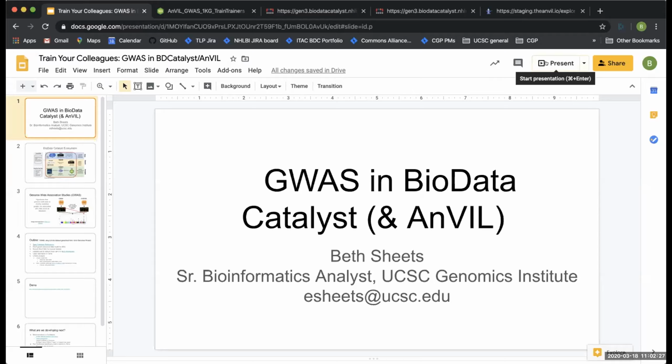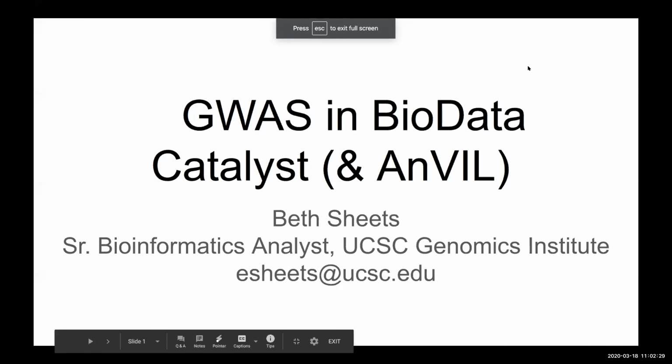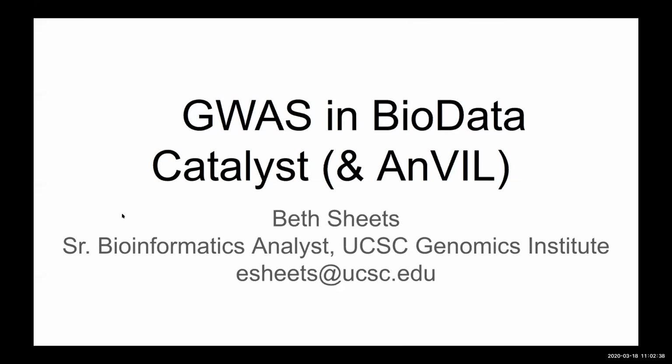So I'm just going to go over a few slides to start to give a little intro of what I'll cover, but I'll mostly be demoing to you all how to do a genome-wide association study in the BioData Catalyst ecosystem. And I think we've heard a lot about all the different platforms that make up the BioData Catalyst system. And I'll try to explain the part of the ecosystem that I'm working in and how that is very similar to eventually, I think, what the AnVIL will look like.